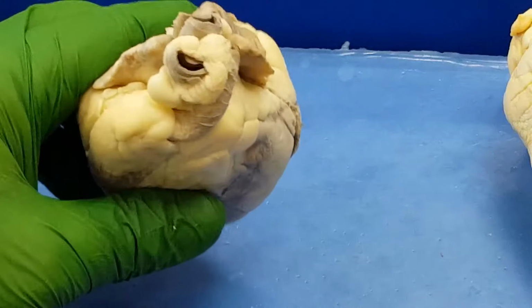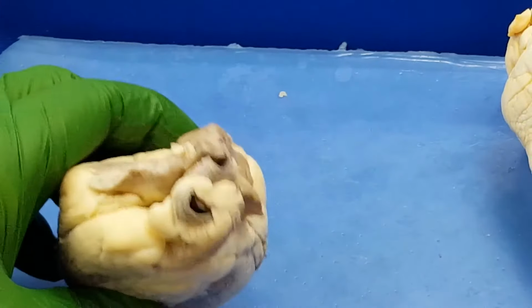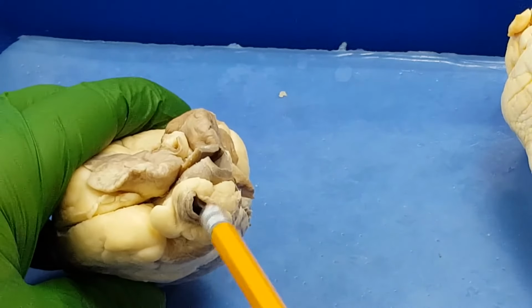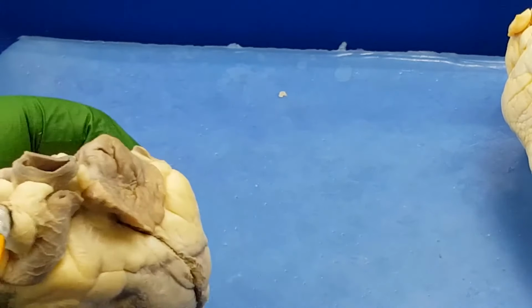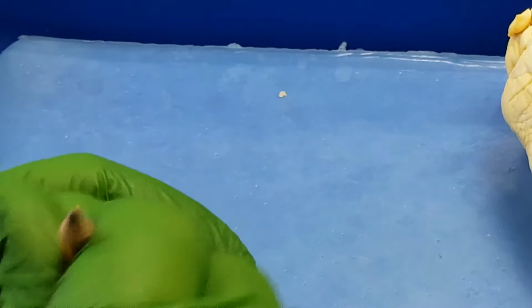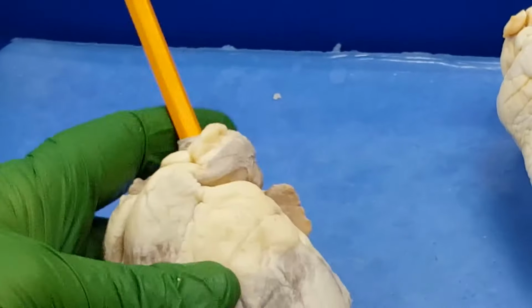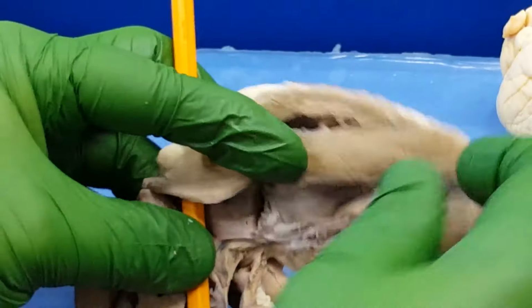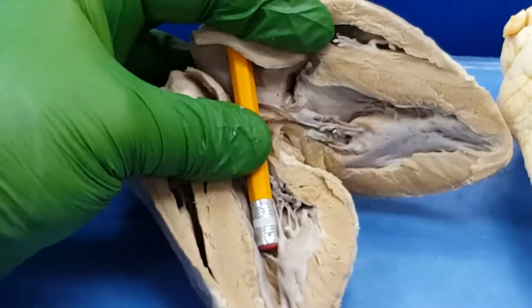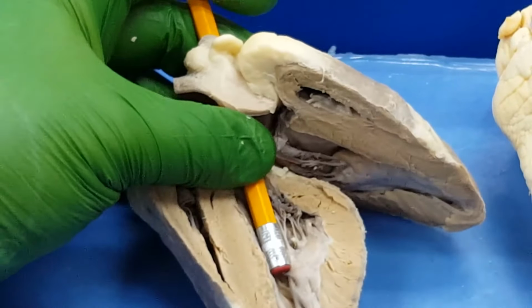So notice these two great vessels at the top side of this particular heart. What I'm going to do is stick my pencil into one of them and see where it comes out. So I find a great vessel, I cram my pencil into it, and notice my pencil just goes somewhere, doesn't it? Where is the tip of my pencil, the eraser end? What chamber of the heart is it in? It's in the left ventricle.